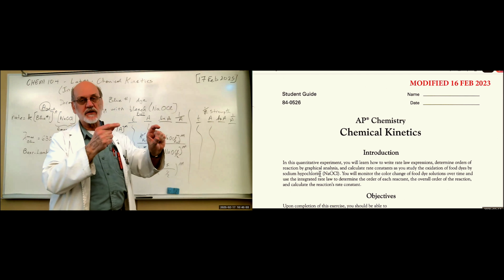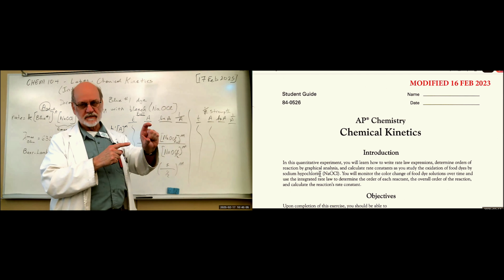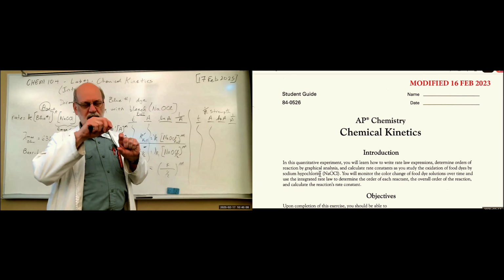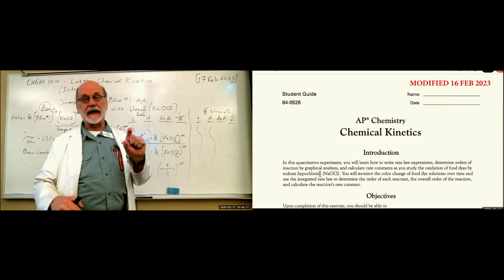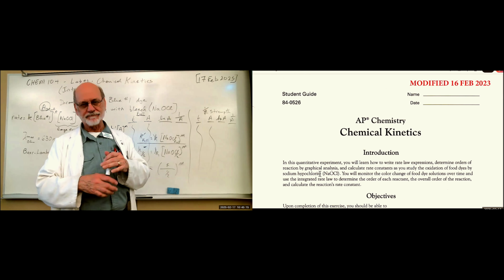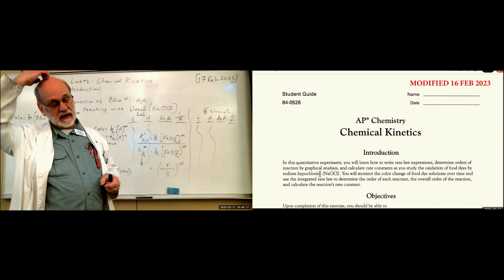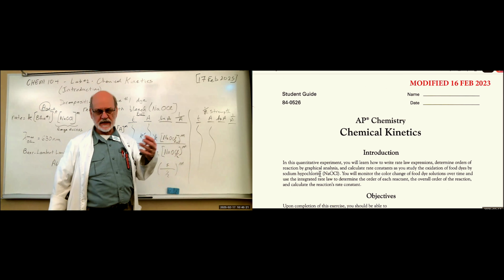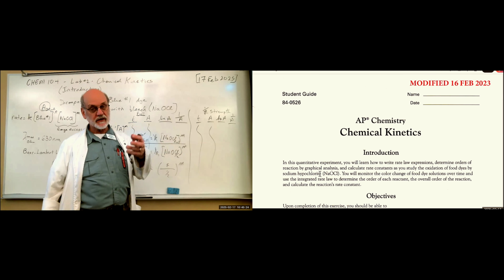Because once you add that bleach, it starts to decolor. The reaction is very quick. So you want to get it in there, mix it a little, and then start reading. And you'll see the absorbance values decrease over time. Of course, when you use half strength bleach, it's going to be slower. It's easier to manage, but still, it's pretty quick.